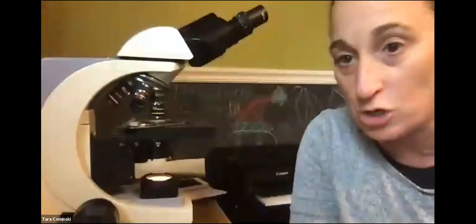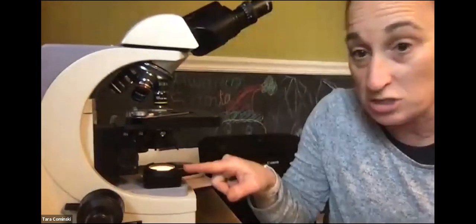Remember, you're going to be following along with your PDF and writing in or typing in those answers, as I said, in that metric system, or that first part of the lab. Okay. Now it gives you a little bit of introduction about light microscopes. Okay. And so they're called light microscopes because light rays pass through. And if you look here at my microscope, right, there's a light source.